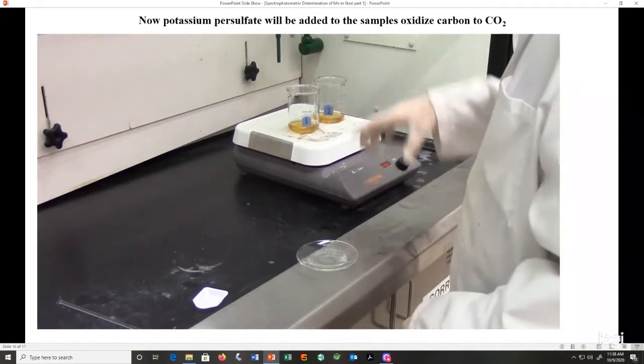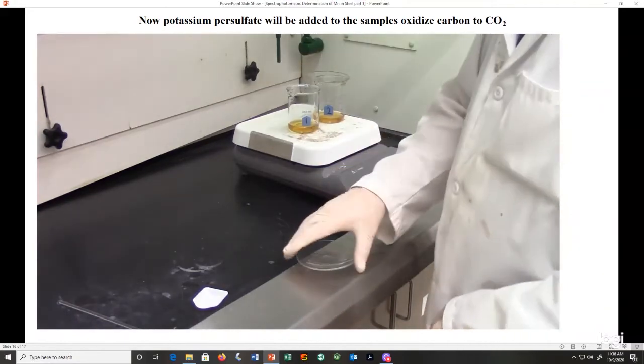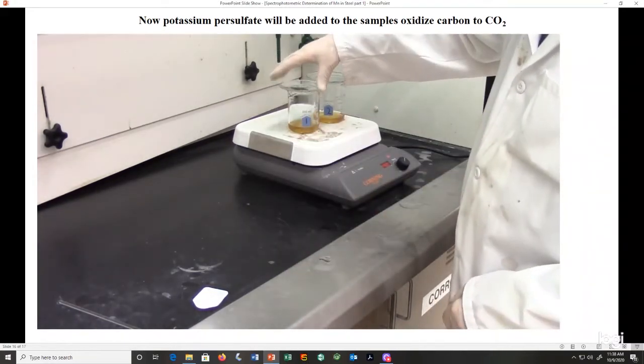At this point, we're going to let them boil for about 15 more minutes, and then we'll take them off the heat.